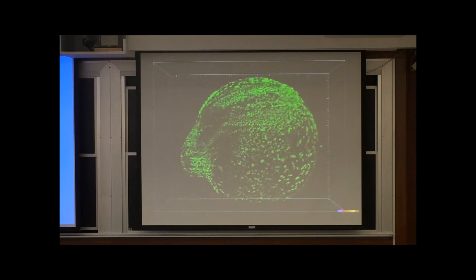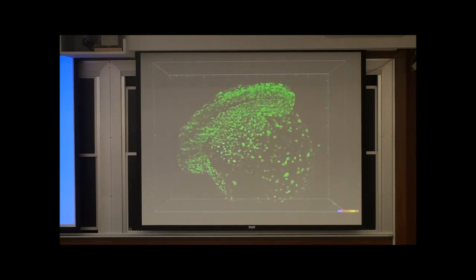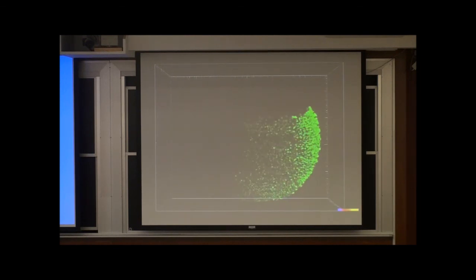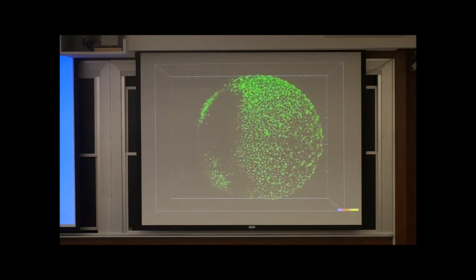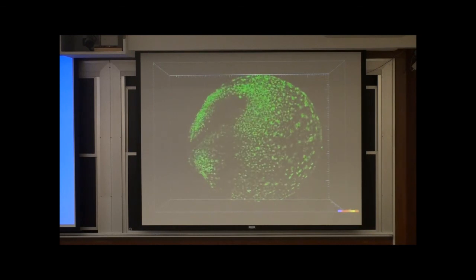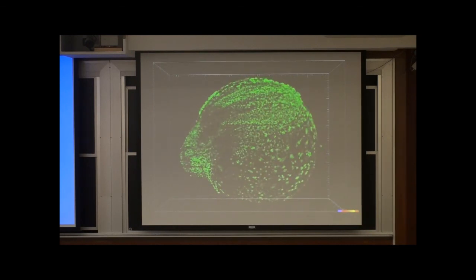I have some objectives which I can use to narrow it down. But then the sides are much wider, because as you focus it, particularly as I was interested in that large field of view, I compromised in the width, but the spread is around 3 to 5 micron.